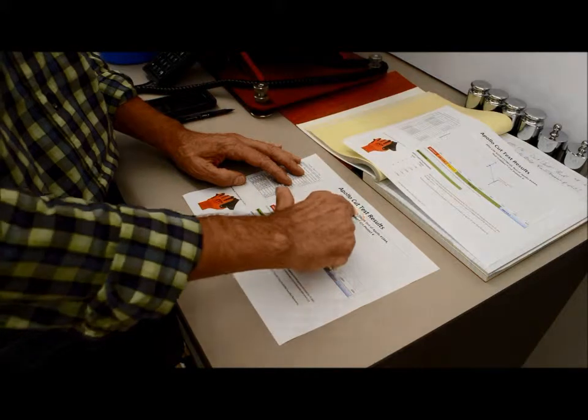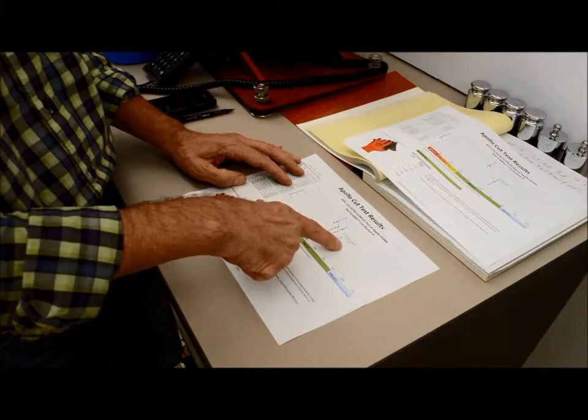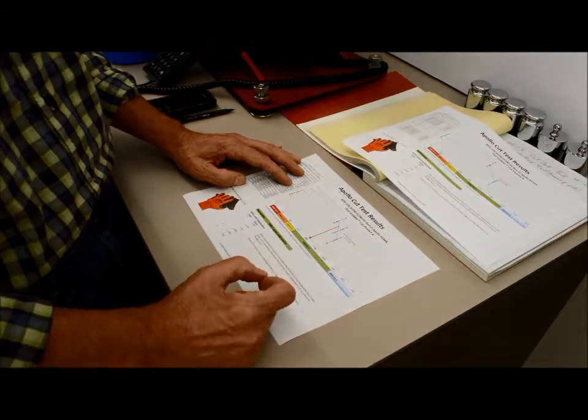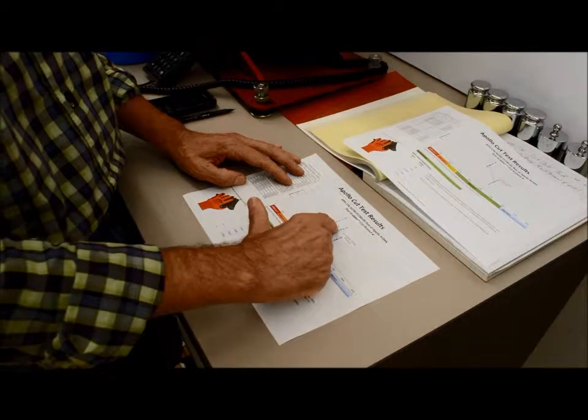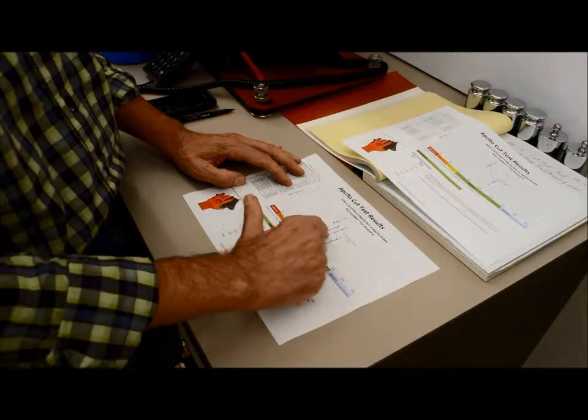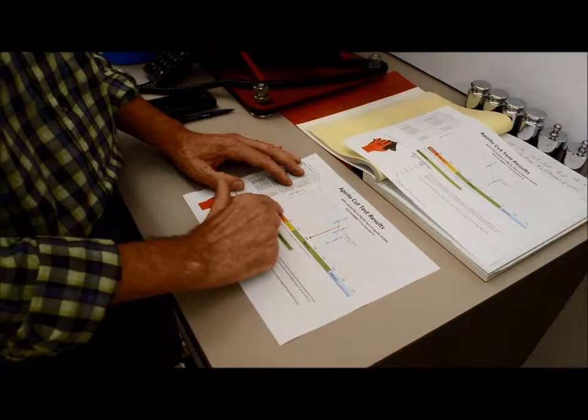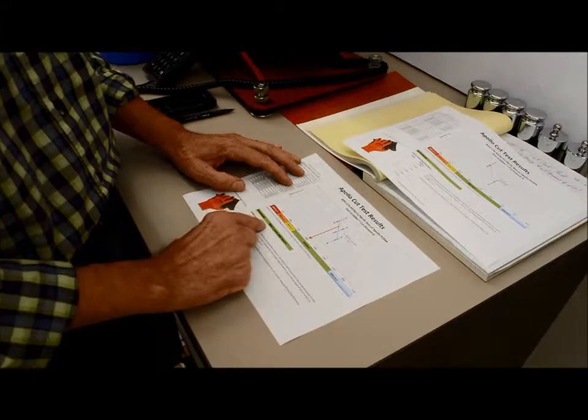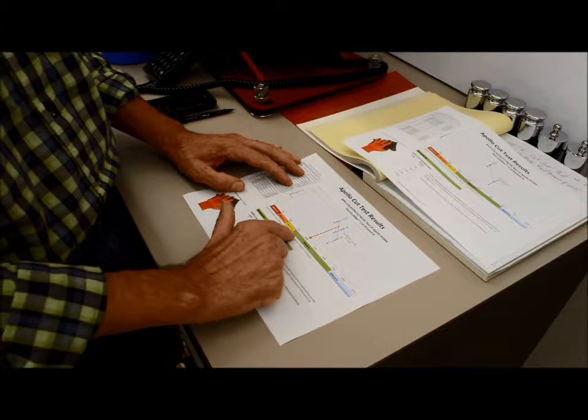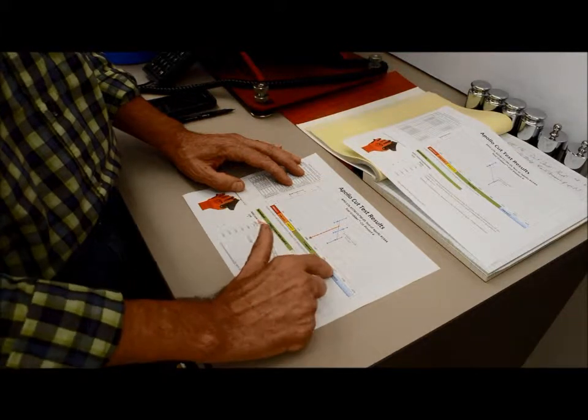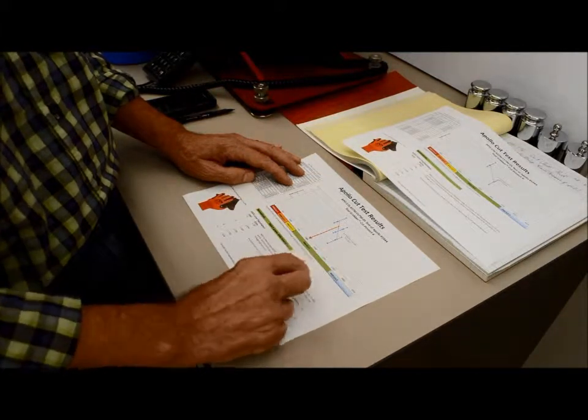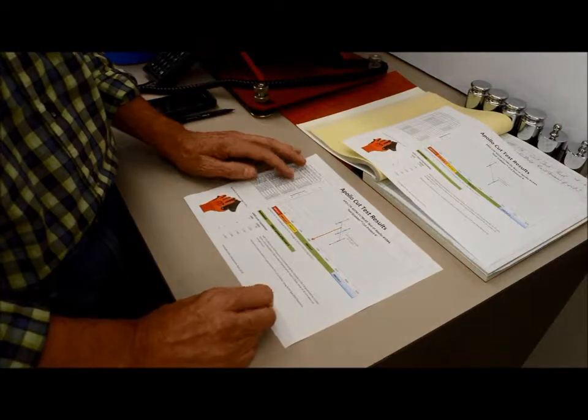If you look at the code here, we've done the ASTM test. We've graphed all of the 15 data points. We've calculated where 20 millimeters of blade travel crosses the line of the weights, and we come out with 2,009 grams, which is an ANSI cut level 4. Well into the ANSI cut level 4 for an excellent cut level 4 rating.